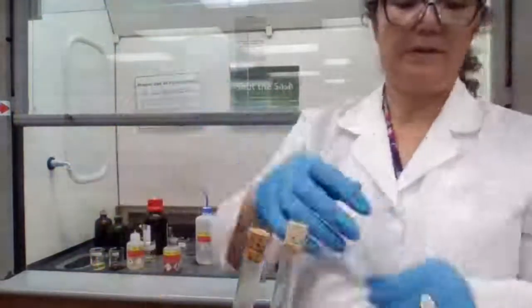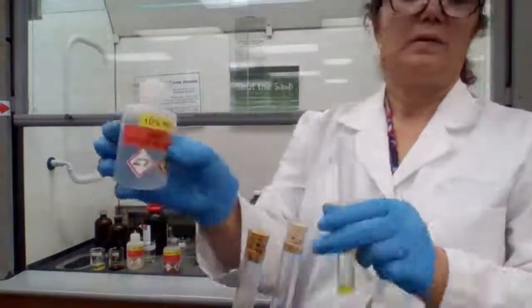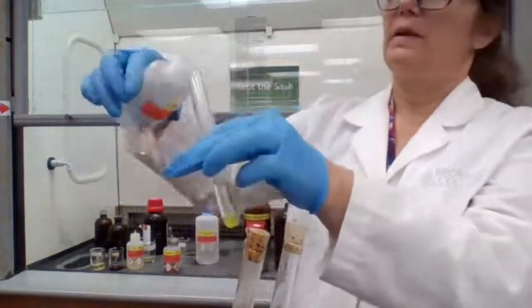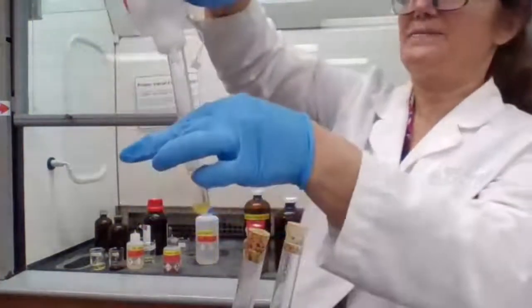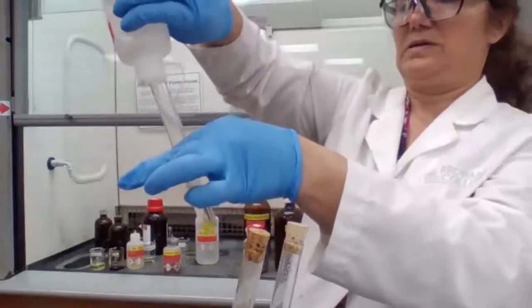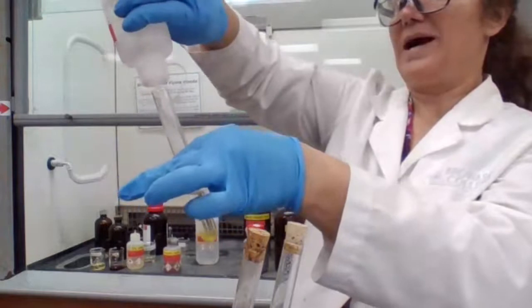For tertiary, we are adding HCl. For tertiary, it is expected to go to solution. So for tertiary, we're going to add the HCl.